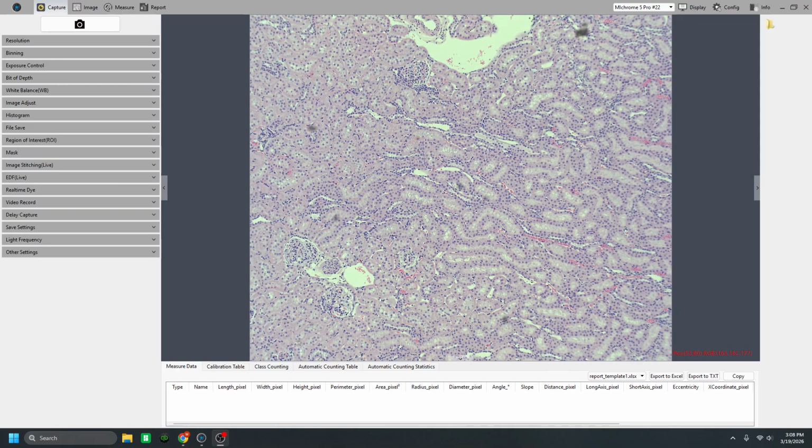And today I'm going to be giving you a quick tutorial on the basics of the Mosaic 2.4 software. If you've seen some of our other videos, you know I've covered Mosaic 3.0 and 3.1, but a lot of the cameras still shipped and a lot of the ones people are receiving have a USB drive that comes with this base software. So I thought it would be good to go over this in case anyone is still on this and wants to know how to use their camera.